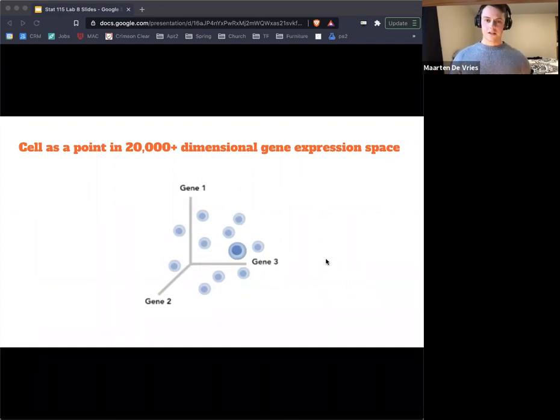And this is what initiatives like the Human Cell Atlas do, which aims to give us a reference map of all cell types in the body. And this is going to be incredibly useful. If you have, say, a diseased tissue sample, right? And then you want to compare that to a healthy sample, you can now just tap into that big database of healthy cells, and there will be maybe tens of thousands of them perhaps for each cell type. I think the aim is to have 1 billion cells by the end of the decade or something like that. So it's very, very ambitious.